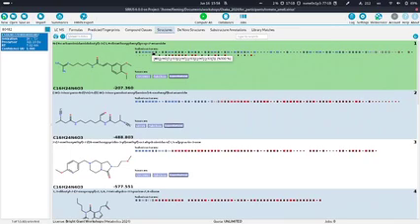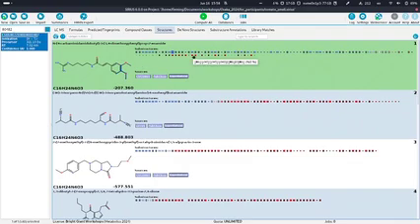If you hover over it, you see the SMARTS of the substructure, and you see that it has a 100% posterior probability. These are only the substructures which are present in this structure hit. If we click on something, it will be highlighted here. The red boxes mean that we predict it to not be present, for example this part. And the size of the box, for example this very tiny box, means that the predictor quality is not very high, so you should probably not trust it that much.